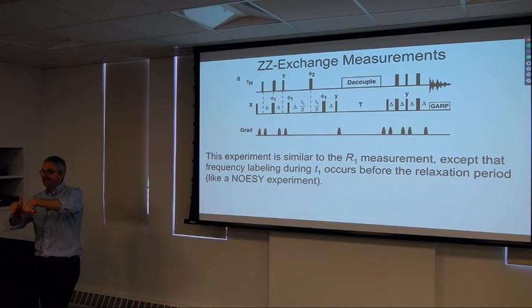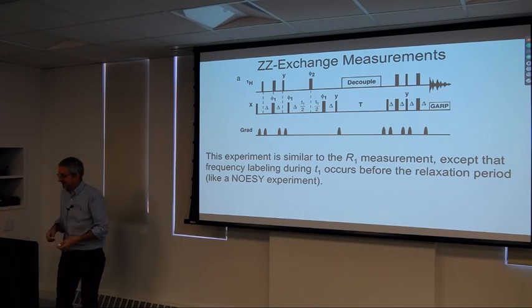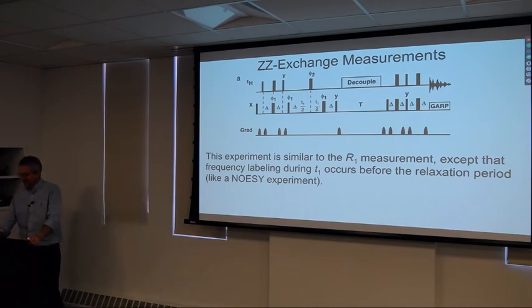And that's what we need for this experiment to work. We need there to be a difference between their amplitudes. If they always had the same amplitude, it wouldn't matter whether they were upside down or right side up, we wouldn't see any net effect. But the cosine modulation means they have different amplitudes and sometimes they point in other directions, and therefore we'll see population transfer.